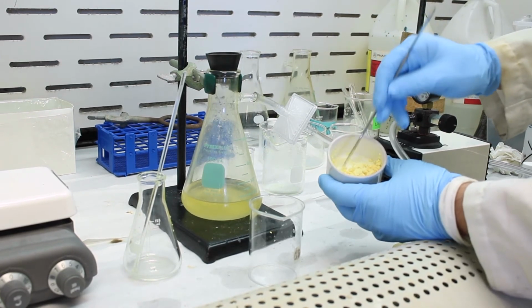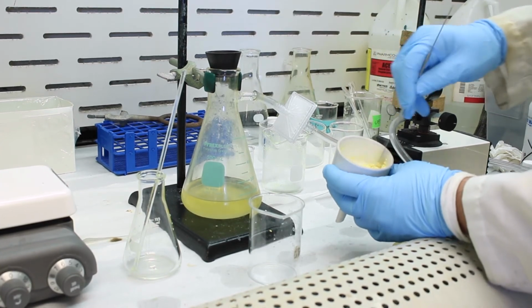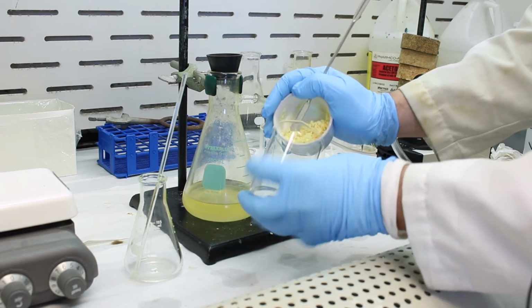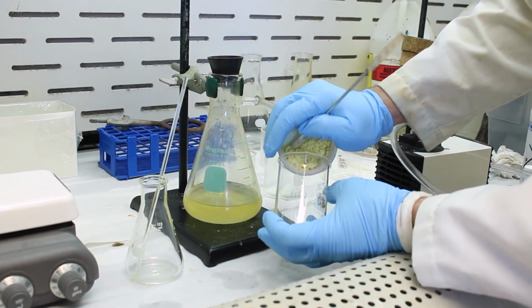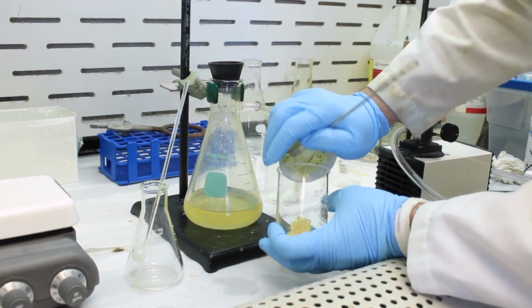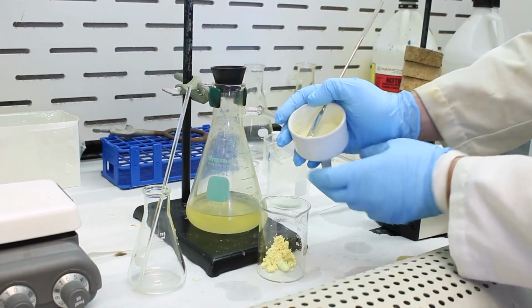As you can see, it's still fairly damp. So we also would not want to use this as our final product due to how wet it is. So we're going to try to see if we can get it into this beaker. We'll take the stir bar out before we get the rest of it.